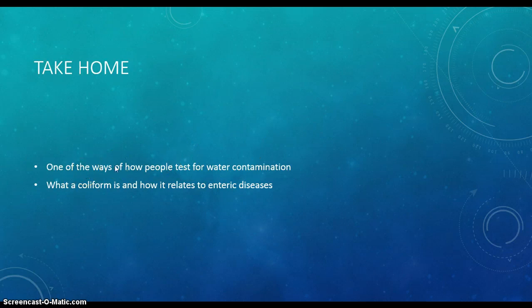And so also we got to see how some of these concepts are crossing over from experiment to experiment. So it is a very important test to know, and make sure you know all the components of it and what a selective and a differential medium is for the final and midterm.